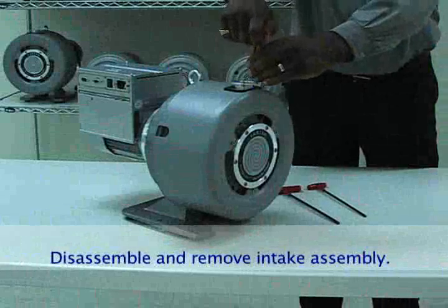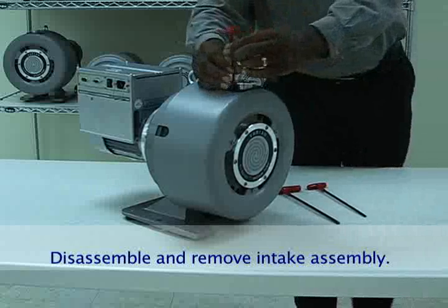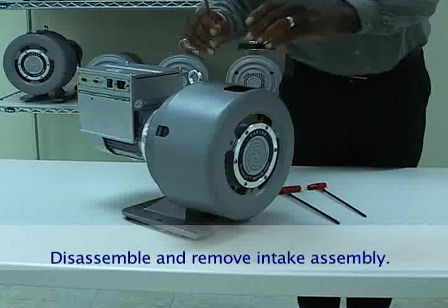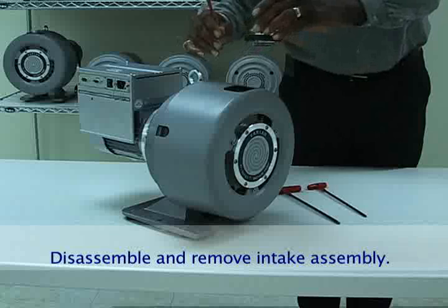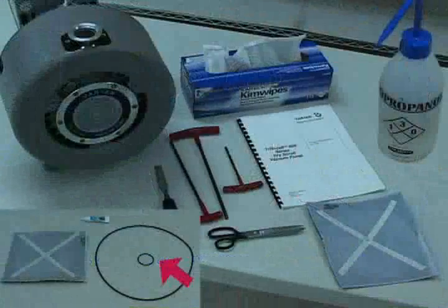We begin by disassembling the inlet flange. Remove the two M5 screws from the intake assembly and pull the assembly from the top of the pump. Remove and discard the O-ring from the underside of the intake fitting. A new O-ring comes with the tip seal replacement kit.